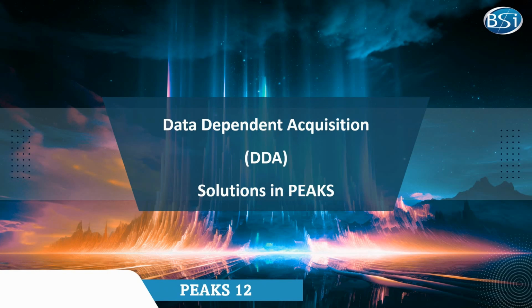Welcome to the PEAKS 12 Data Dependent Acquisition video tutorial. In this video, I will explain how the DDA database search works in PEAKS, how to set up the workflow, and how to view the results.